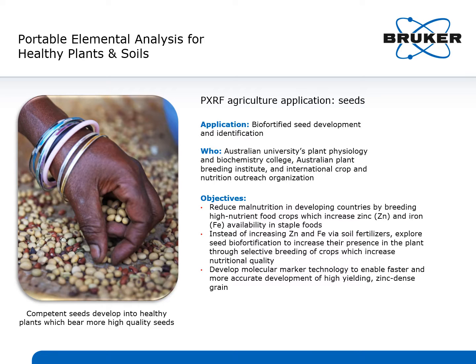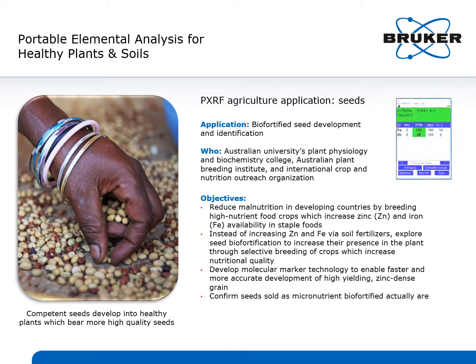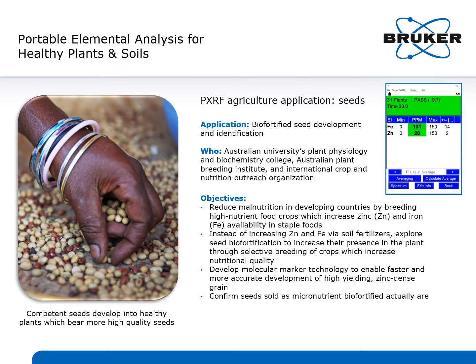Portable XRF is helping them track seeds which yield nutrient-dense grains faster and more accurately. They also use portable XRF to confirm that seeds labeled as biofortified at supply stores are in fact biofortified with micronutrients and not just priced as such. These scientists utilize both laboratory and portable XRF to develop successful biofortified seed technology.